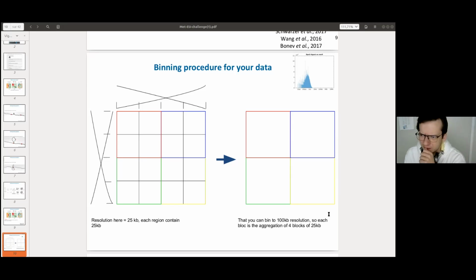So the value for the last bin, it's not enough, 25 kb. So I made the value 0 or 1 or nothing. But if you want to complete, yeah, you will consider the rest is 0. But what Leopold was saying is that this region will be poorly covered, it will not be realistic because you put some zeros. So if you want to look at this region carefully, then you need to stay at 25 probably.